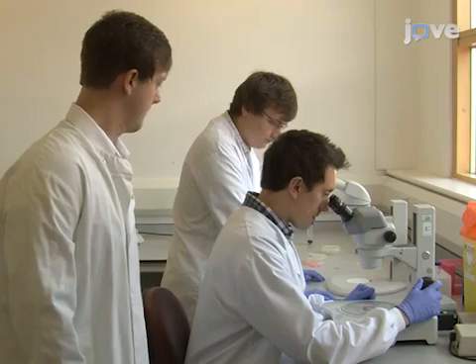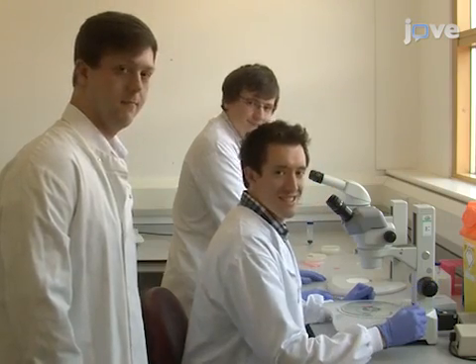Generally, individuals new to this method will struggle with prospective movement assays as worms tend to get stuck in pipette tips. Demonstrating the procedures will be Joseph Bass and Christopher Gaffney, 2 PhD students, and Thomas Barratt, an undergraduate student from my laboratory.